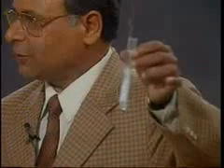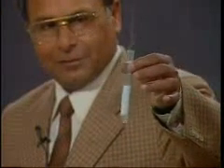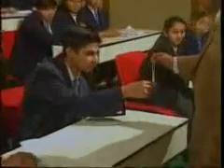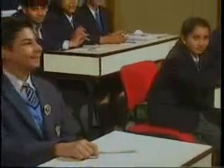You find some change? Yes, sir. Reaction is taking place vigorously. If you want to have a feel, you can touch it also and see what you find. But careful. It is too hot.